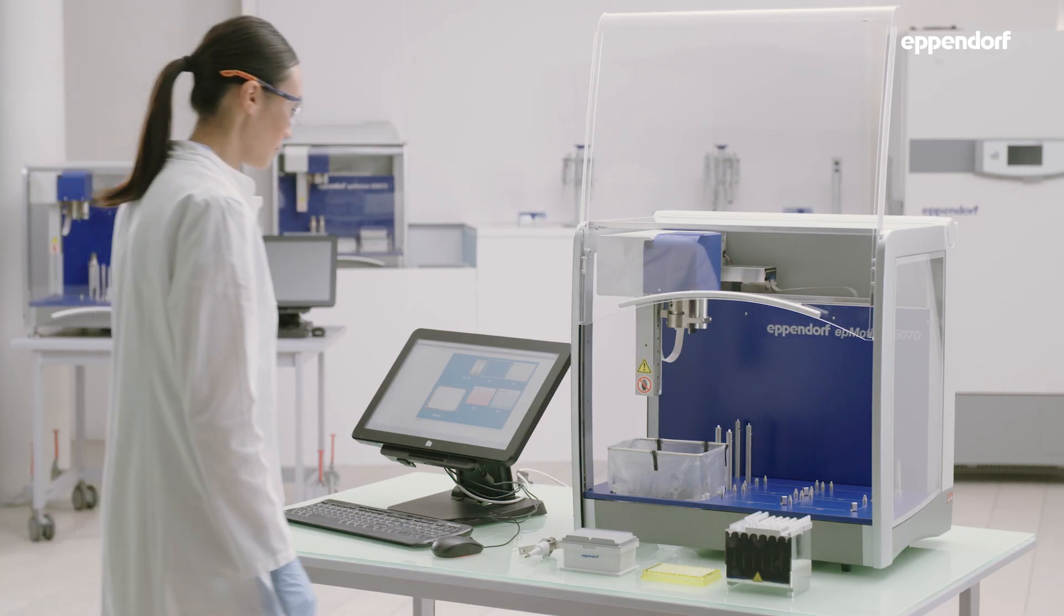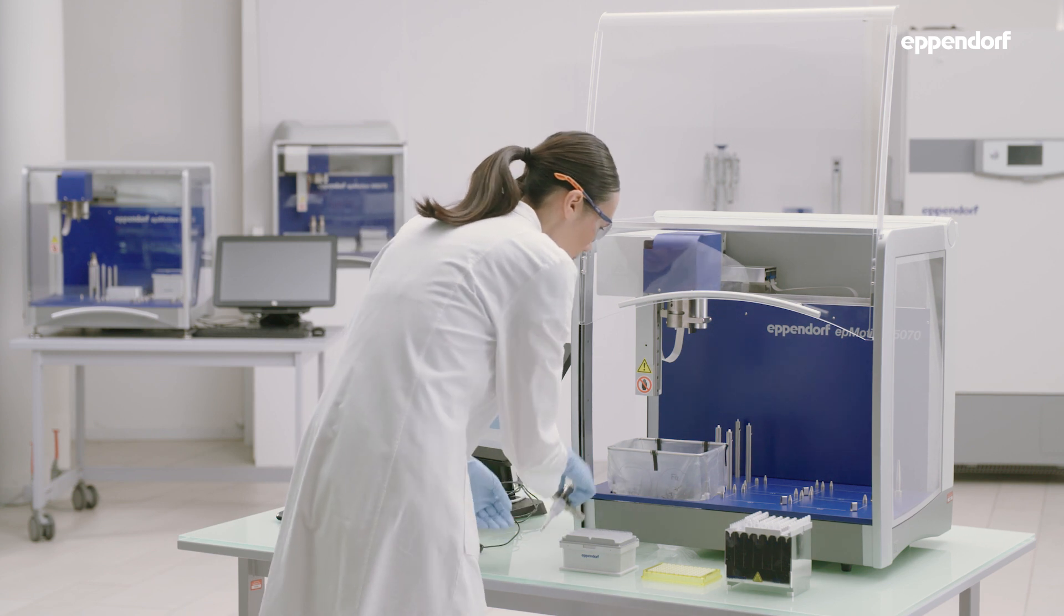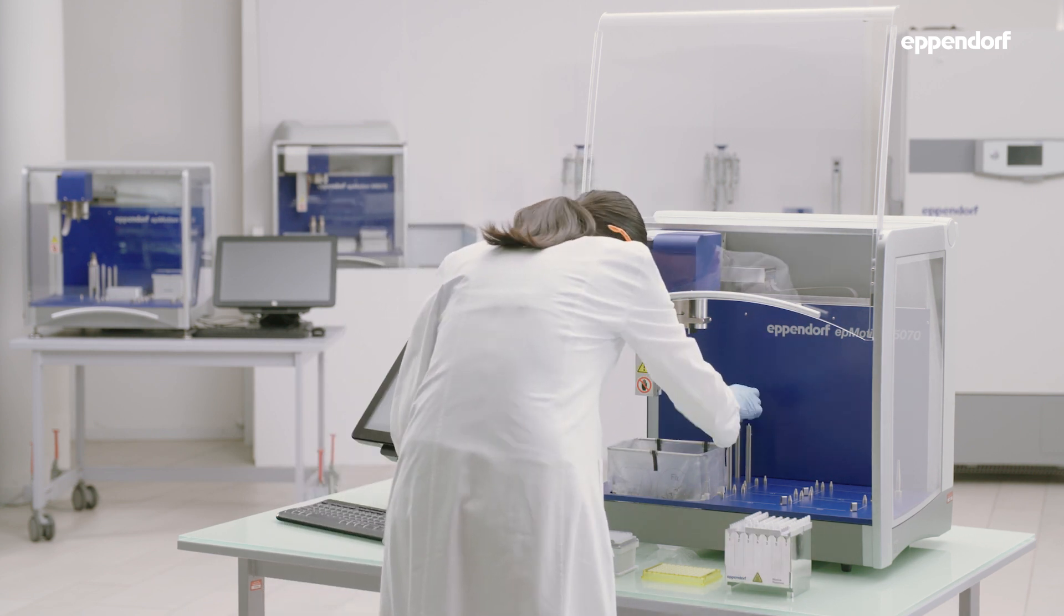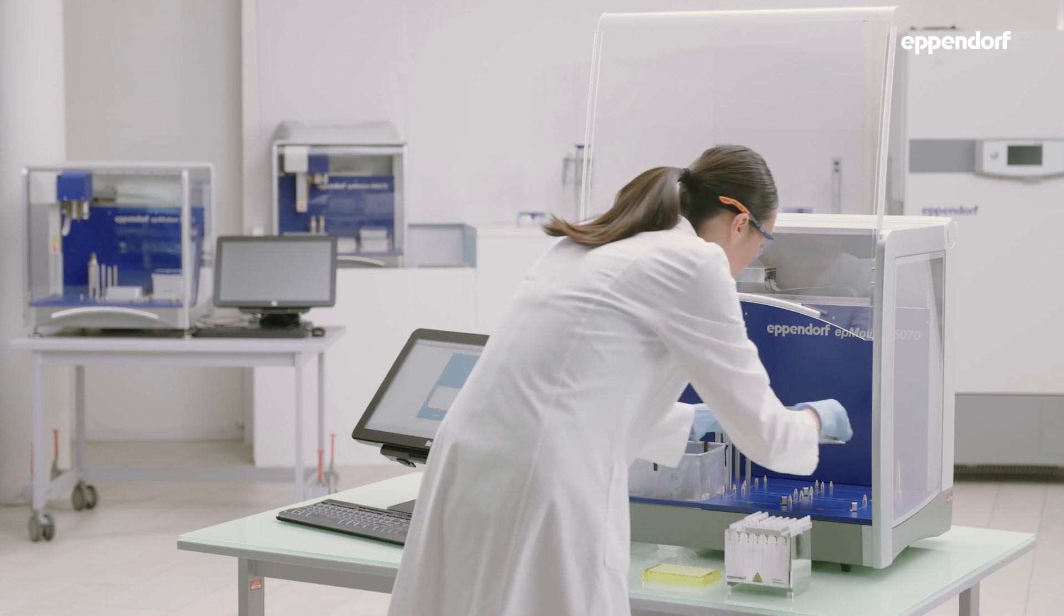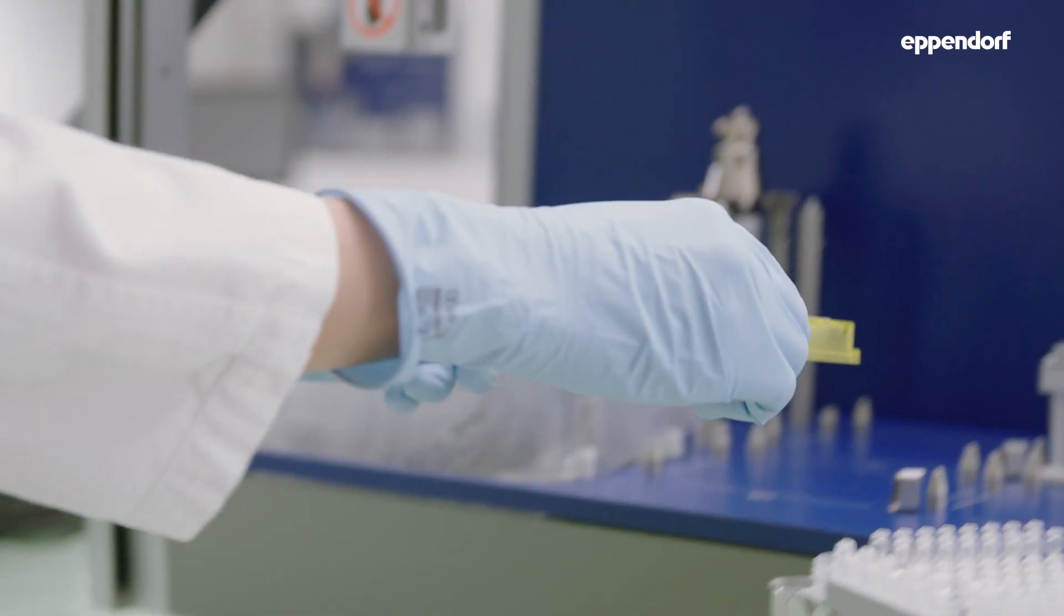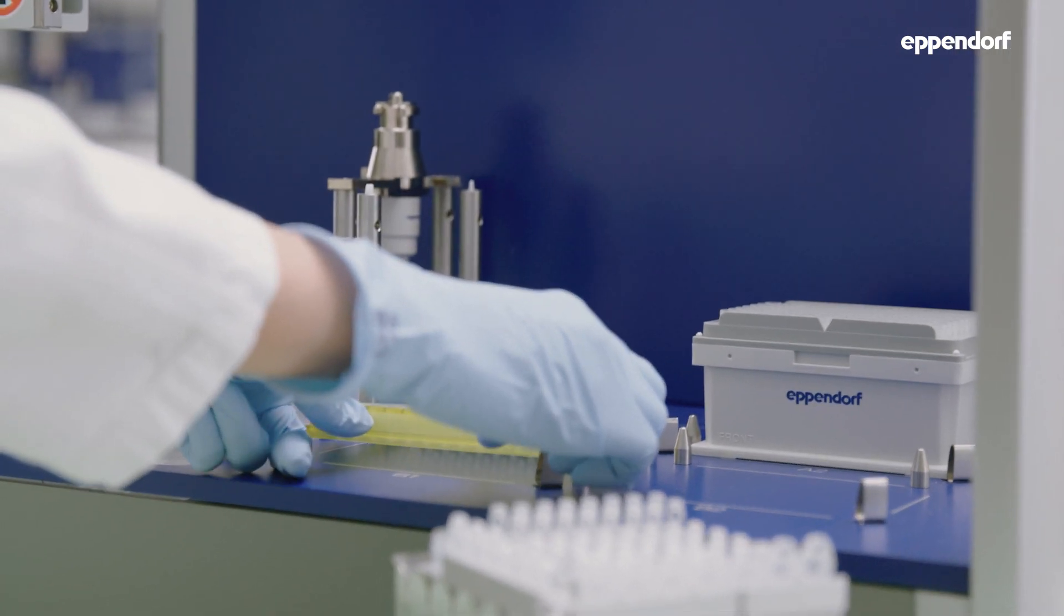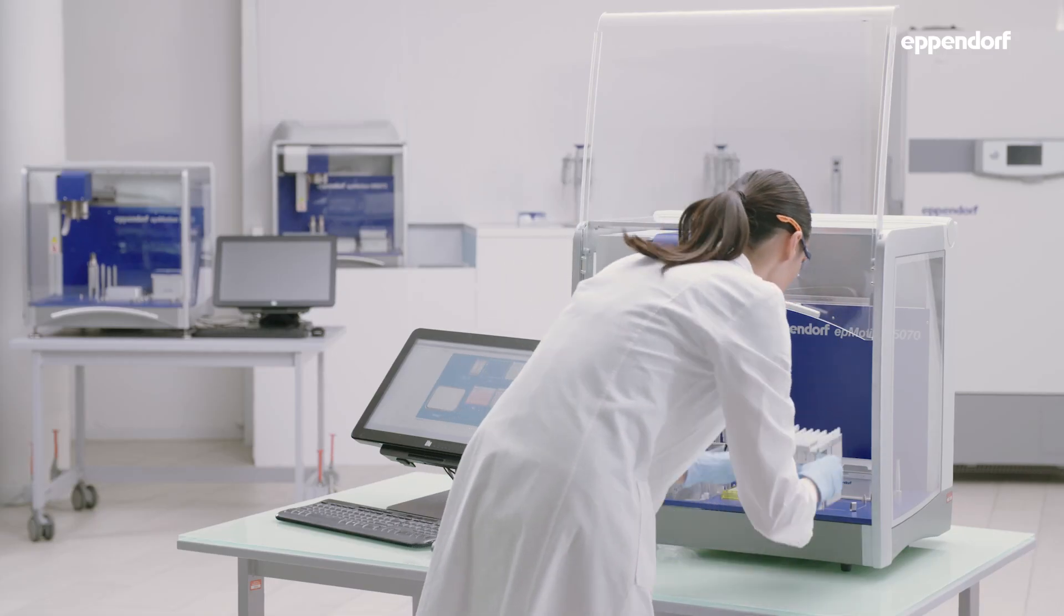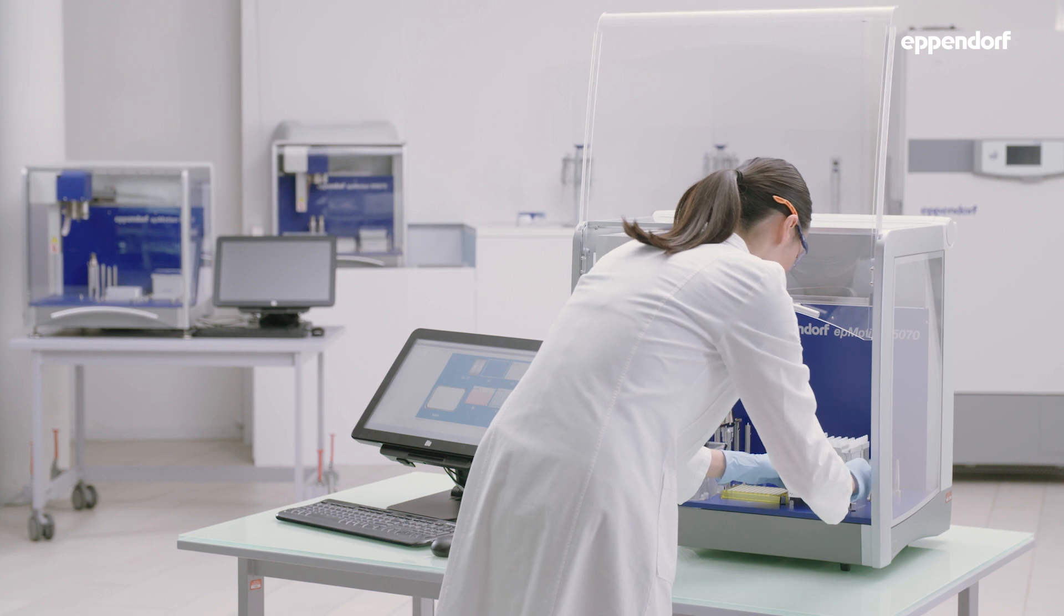In this tutorial, a single channel pipetting tool with a volume range of 1 to 50 microliters is used. It is placed on the deck. The tips that correspond with the pipetting tool being used, a 96-well PCR plate, reservoir rack for your PCR master mix and finally your samples and controls are also positioned on the deck.